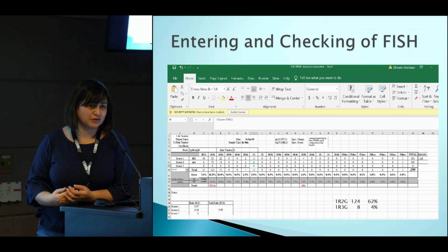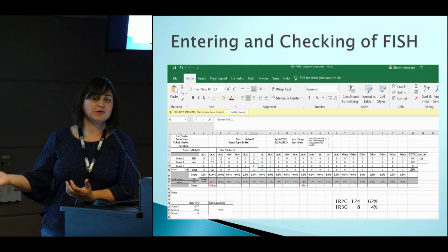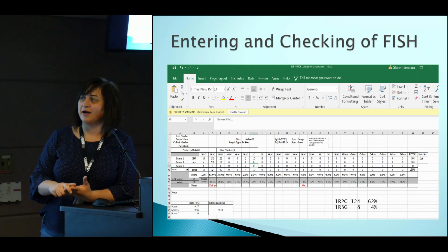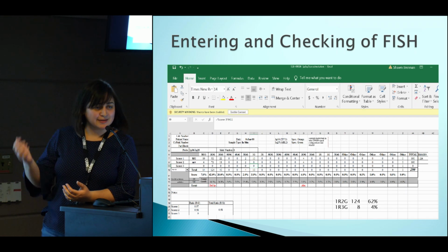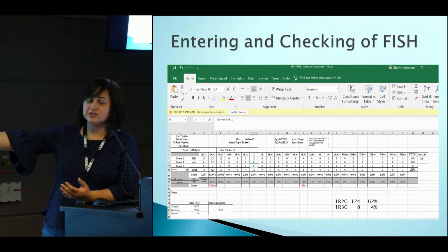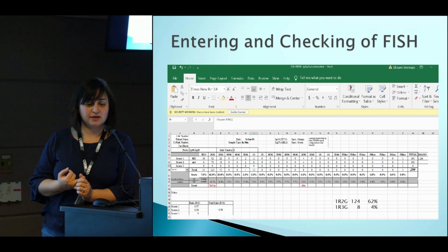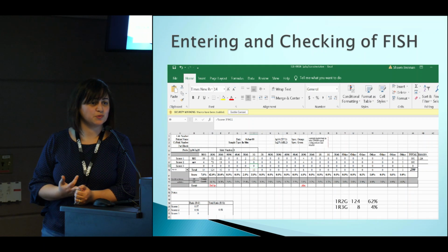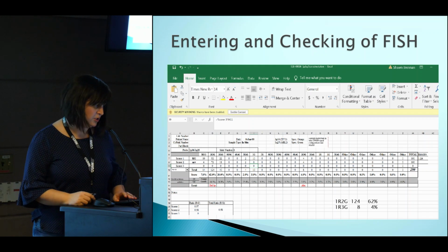Just use the computer. You can always bring up this score sheet. You can enter all the data into COPATH, and then the checker would come and check everything that was entered into COPATH and just attach this score sheet into MetaClient. So all the data, all the images, all the cells analyzed, all the back matter in terms of external requisitions were all in one software, and easily accessible.